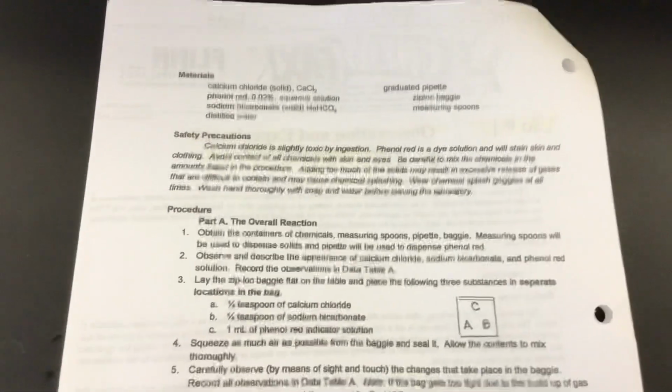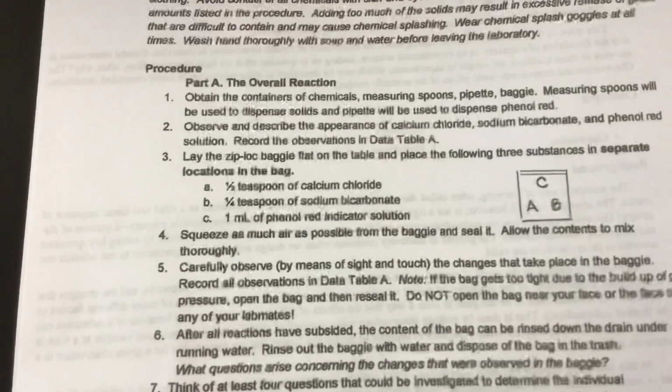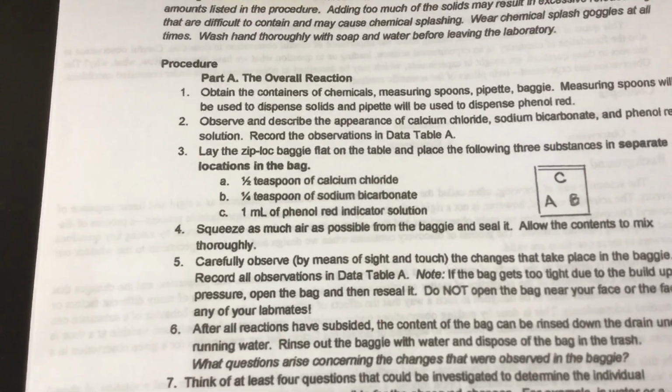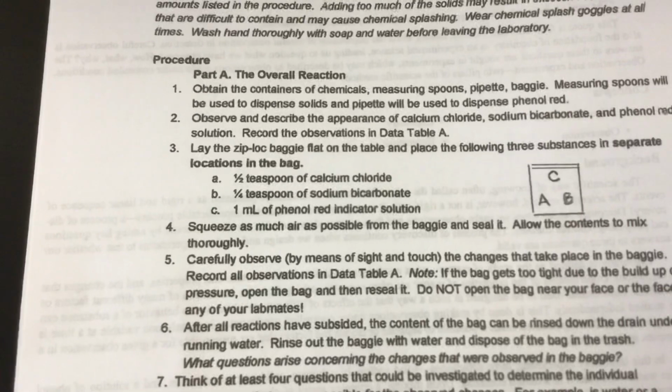You are going to be describing what happens when you see the reaction take place. So part A, the overall reaction. You'll see here, we are going to be mixing half a teaspoon of calcium chloride, 1/4 teaspoon of sodium bicarbonate, and 1 milliliter of phenol red in a plastic baggie.